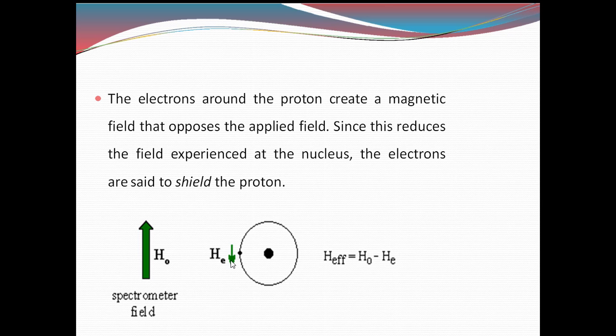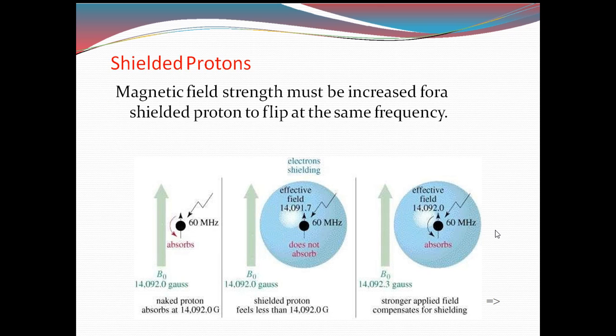In order to get the NMR spectrum, you have to do all these processes, and all these processes take place within the instrument itself. Okay. Sorry, this is some sound from outside.